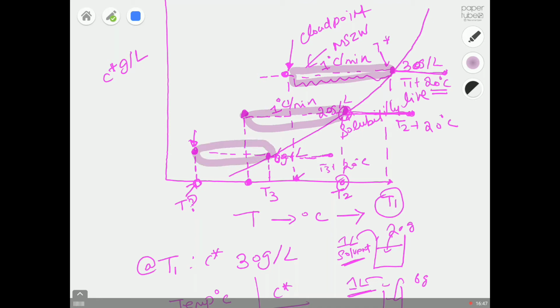So in industries, that's what they do. When they decide to do some crystallization, they have to decide how to produce crystals, whether to grow the crystals or to produce them via nucleation. We will come back to this topic of nucleation. So they need this graph. First they need solubility, and then they need the metastable zone width. So we already did 3 experiments at the moment.